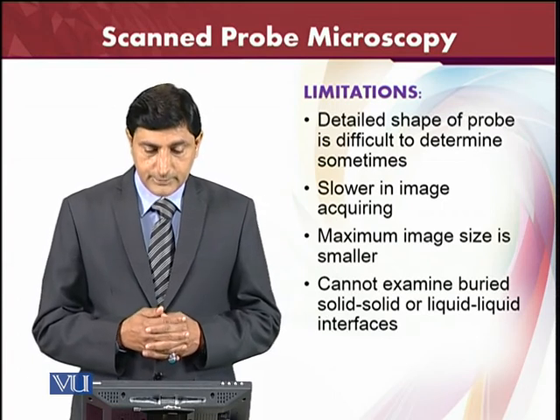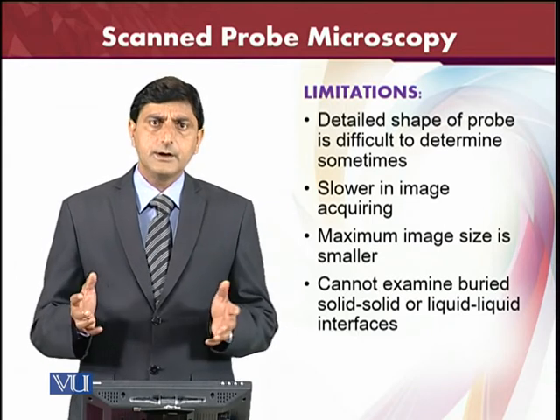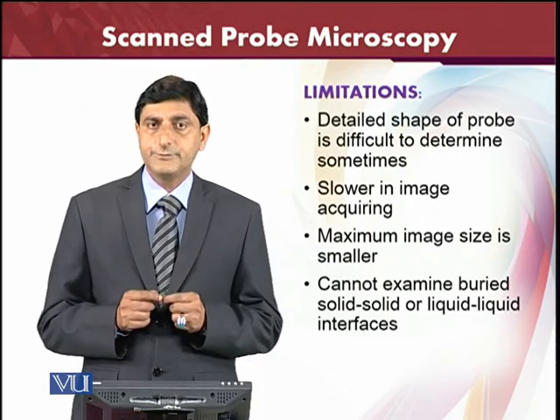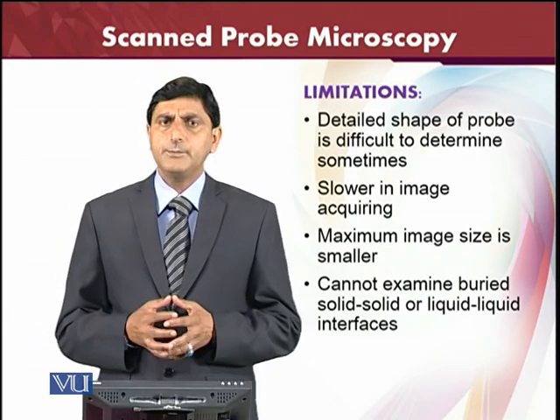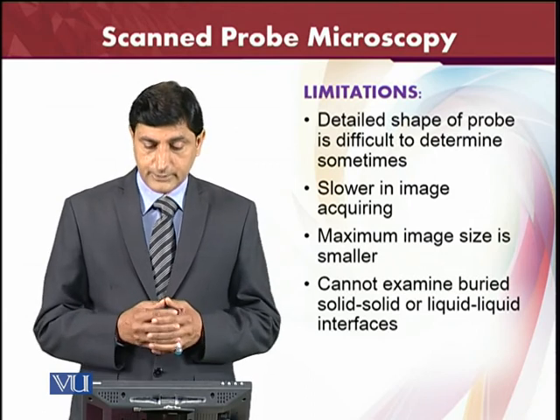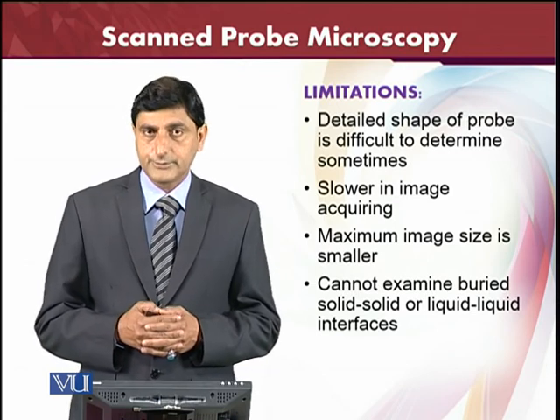It cannot examine buried solid or liquid interfaces, because the basic principle of this kind of microscope is the interaction of the surface with the probe. So we are able to see only the surface, and in detail, but buried surfaces inside solid or liquid interfaces will be difficult to examine under this kind of microscope.